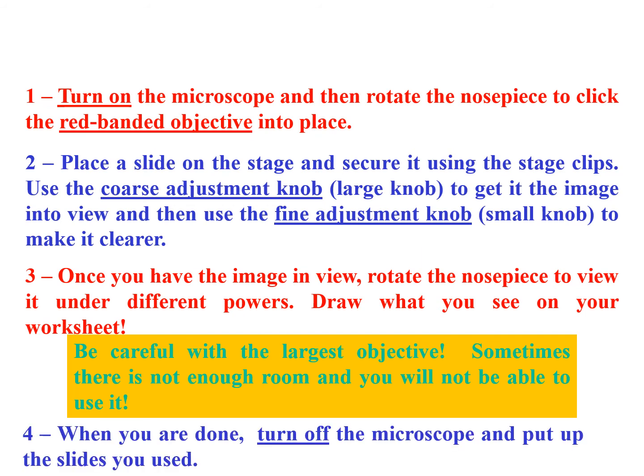Be careful with the largest objective. Sometimes there is not enough room and you will not be able to use it. When you are done, turn off the microscope and put up the slides you used.